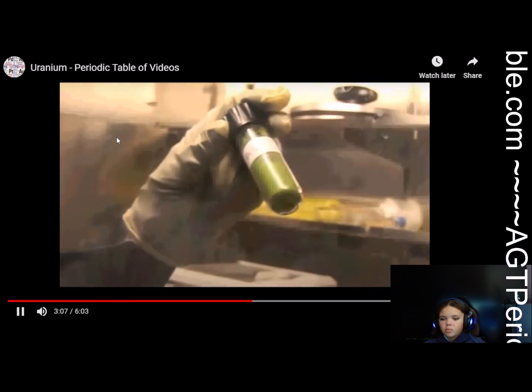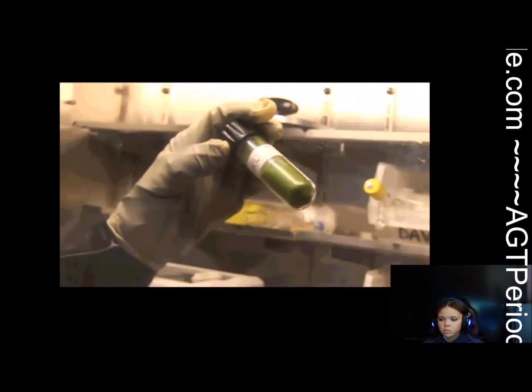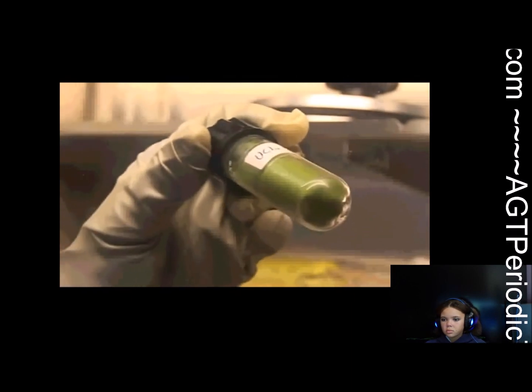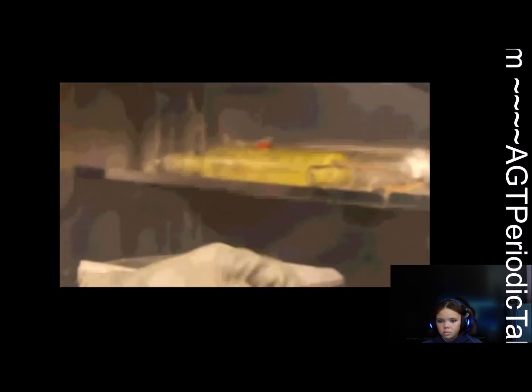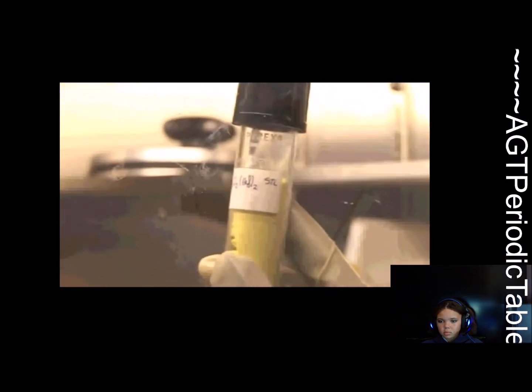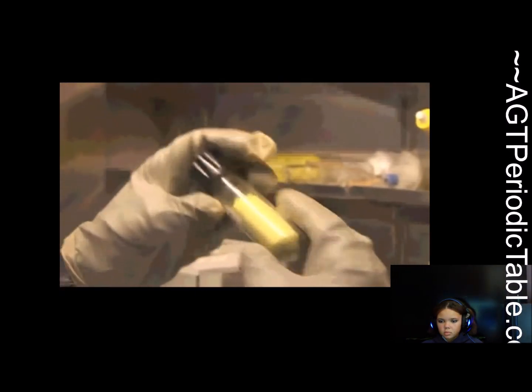This is uranium tetrachloride. It's solvent-free. It's a nice free-flowing emerald green powder. And if you dissolve this in solvents like THF, you get beautiful green solutions from it. And here's another form of uranium. This is uranyl dichloride, which has got two organic molecules coordinated to it as well. That's this beautiful yellow colour.